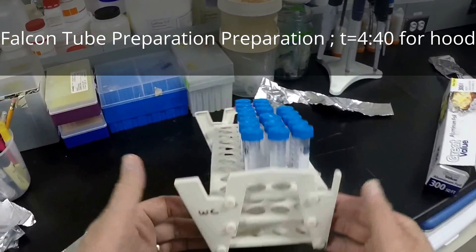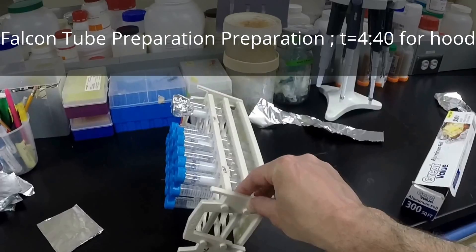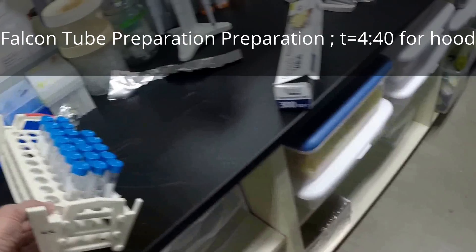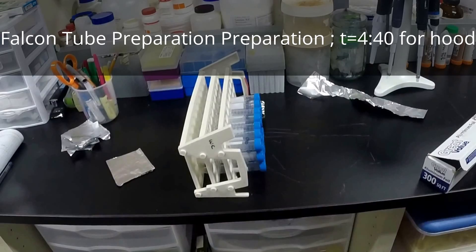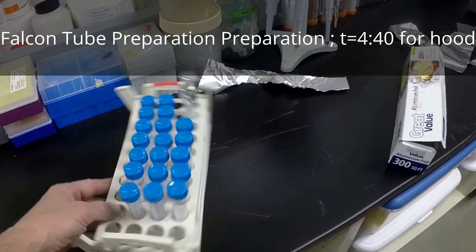For actually making the slants, we have a tray that's designed for that. It's designed so that you can tip it for a relatively low angle slant. But for the algae maintenance, we're going to be doing it at a very high angle. Even at that far, it'll just run out of the bottom slightly and give us about half the depth of the tube. That's our goal here.